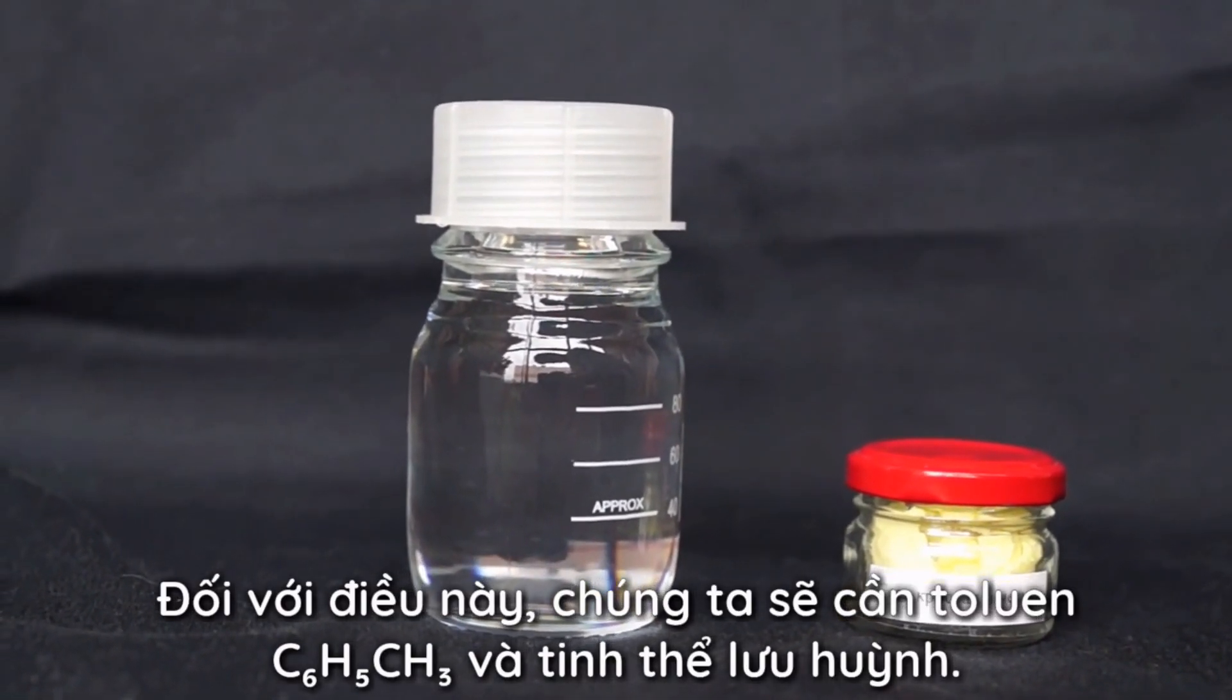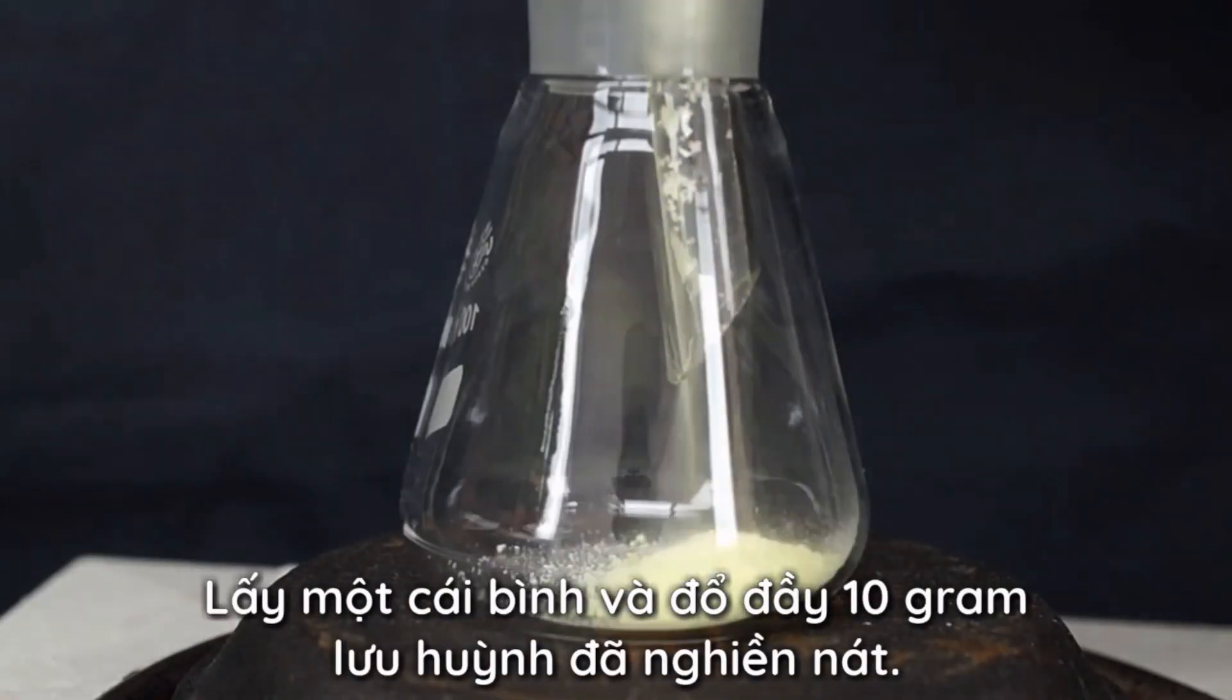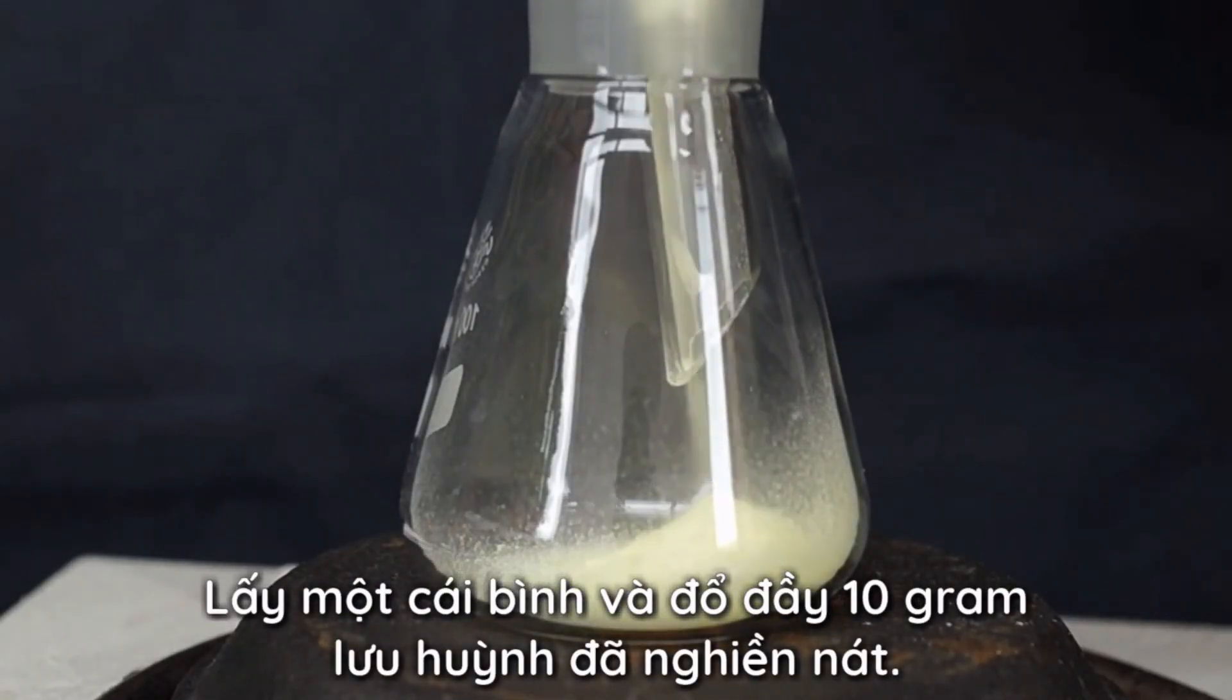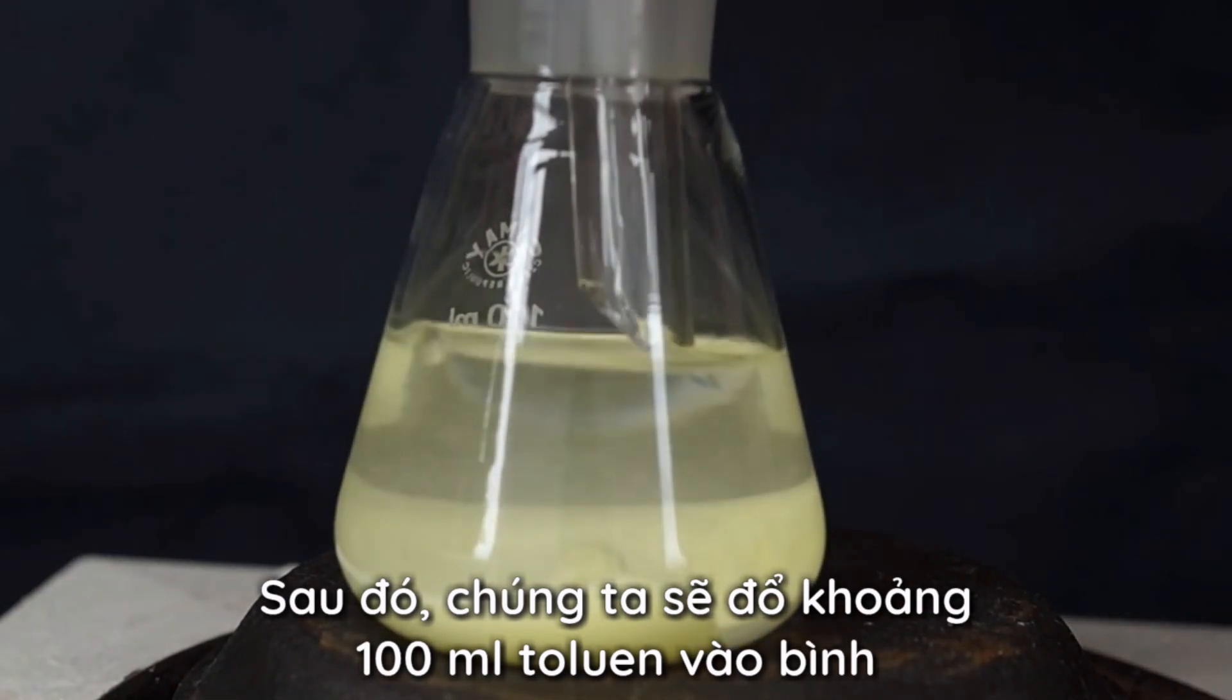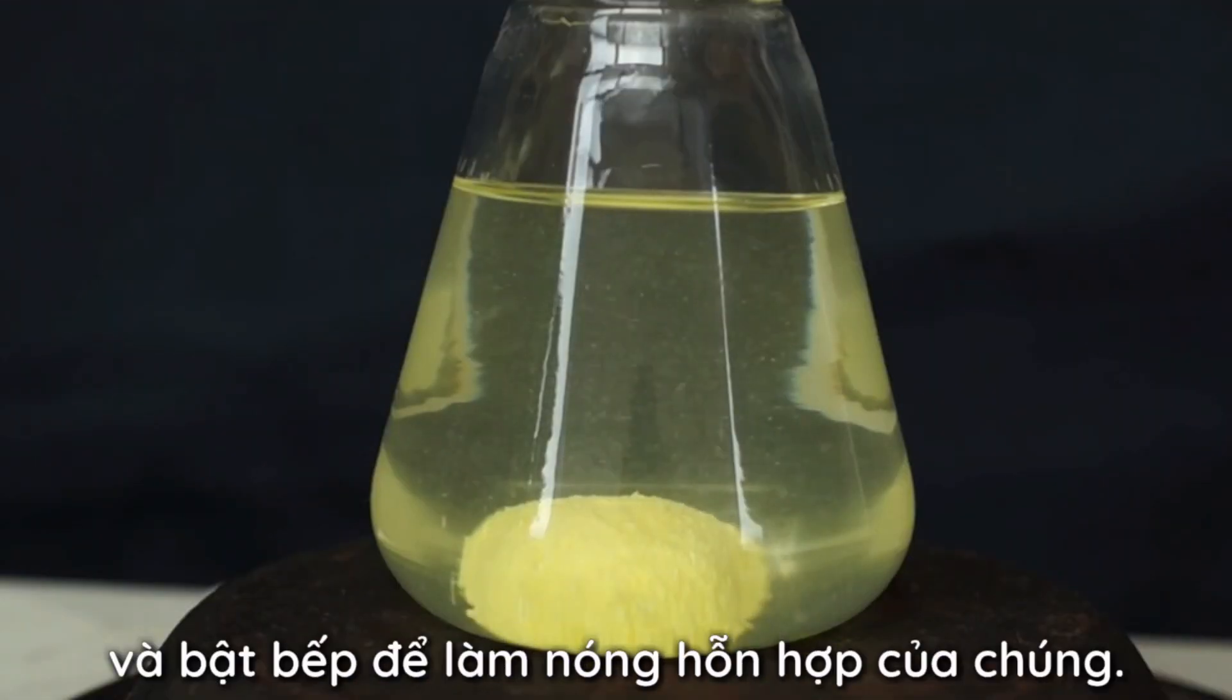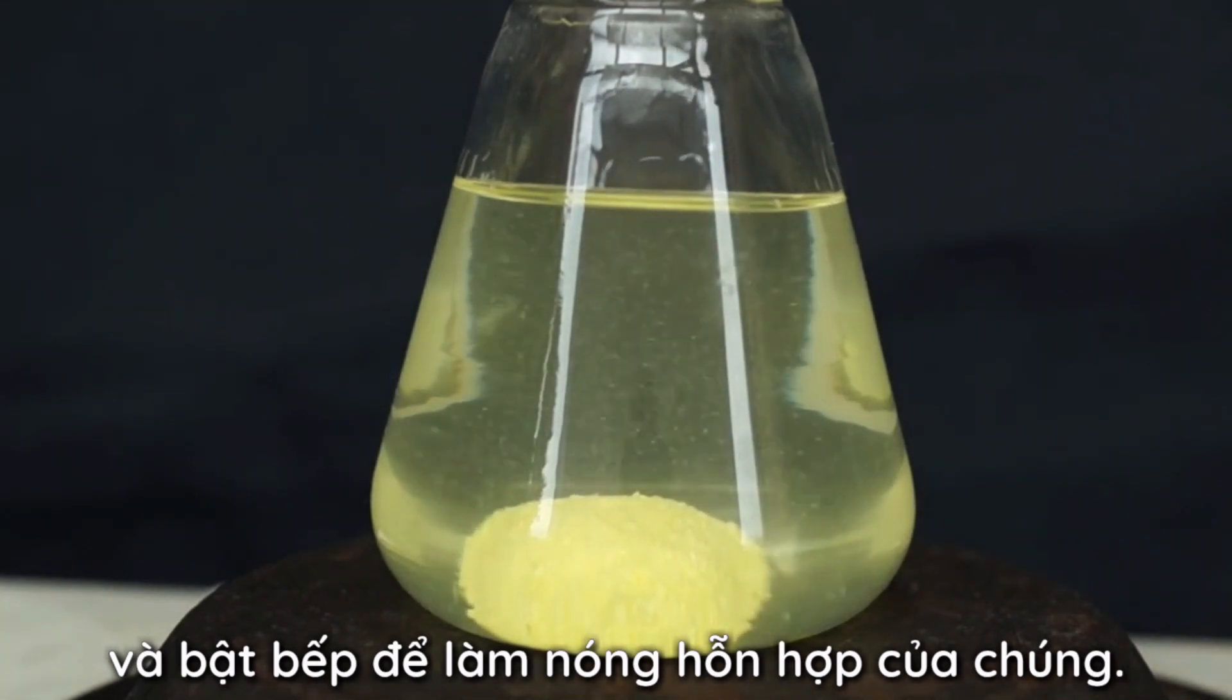For this we will need toluene and crystalline sulfur. Let's take a flask and fill it with 10 grams of crushed sulfur. Then we will need to pour about 100 ml of toluene into the flask and turn the stove on to heat up our mix.